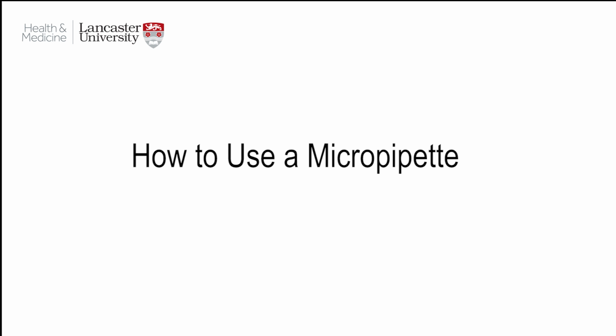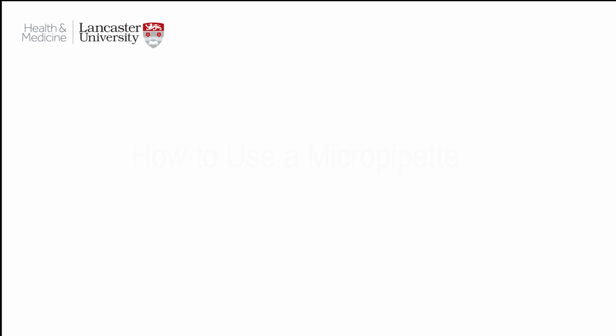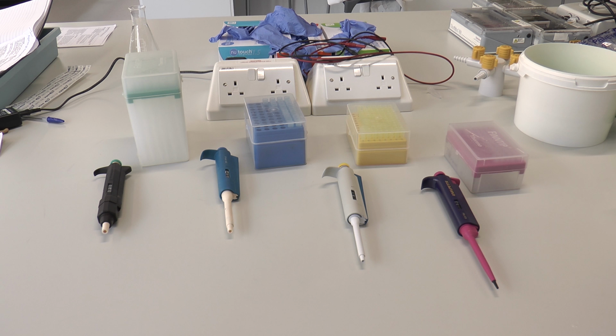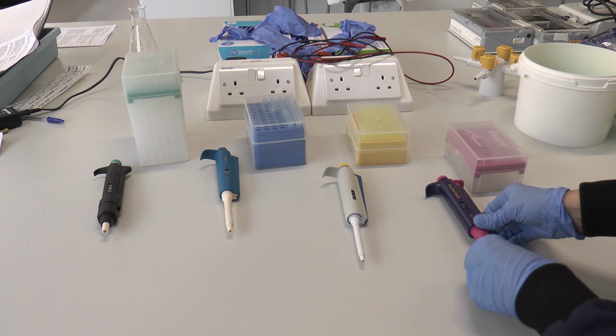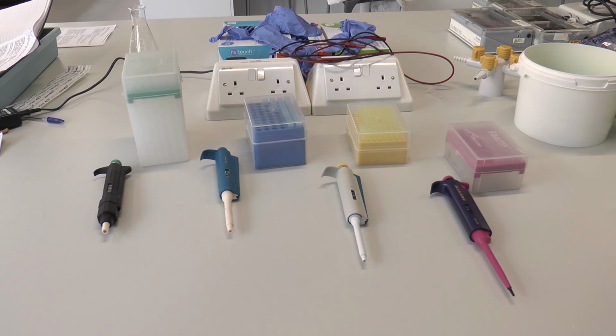This is a short video produced by Lancaster University to show you how to use a micropipette. Here we've got a range of micropipettes that each dispense a certain volume. So when you come to the lab, you're going to usually find that you have pipettes that dispense very small volumes to ones that dispense quite a much larger volume.